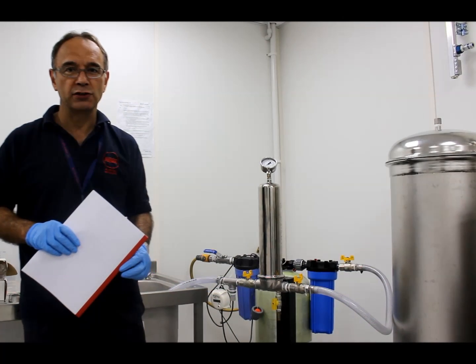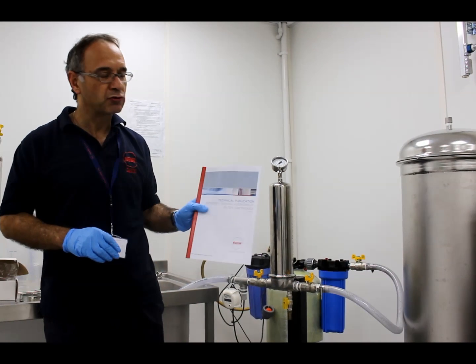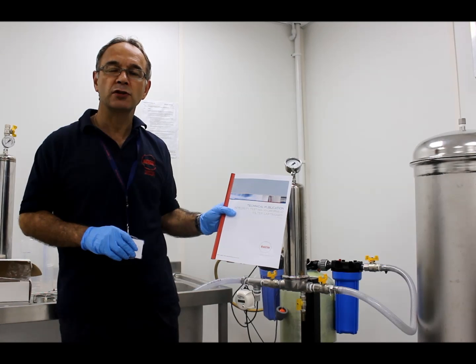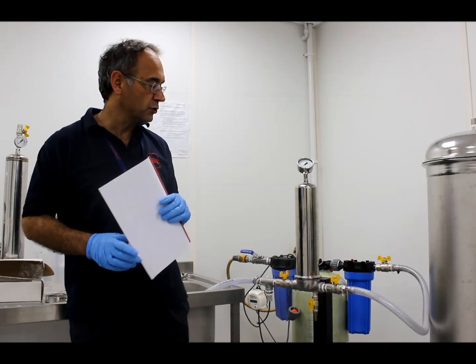The first thing you need to do before you test a filter is to make sure it's fully wetted. The best way to make sure it's fully wetted is to follow the instructions in our technical publications. We have two of these for integrity testing filters — one is for hydrophilic filters and one is for hydrophobic filters. This filter has been fully wetted according to these instructions.